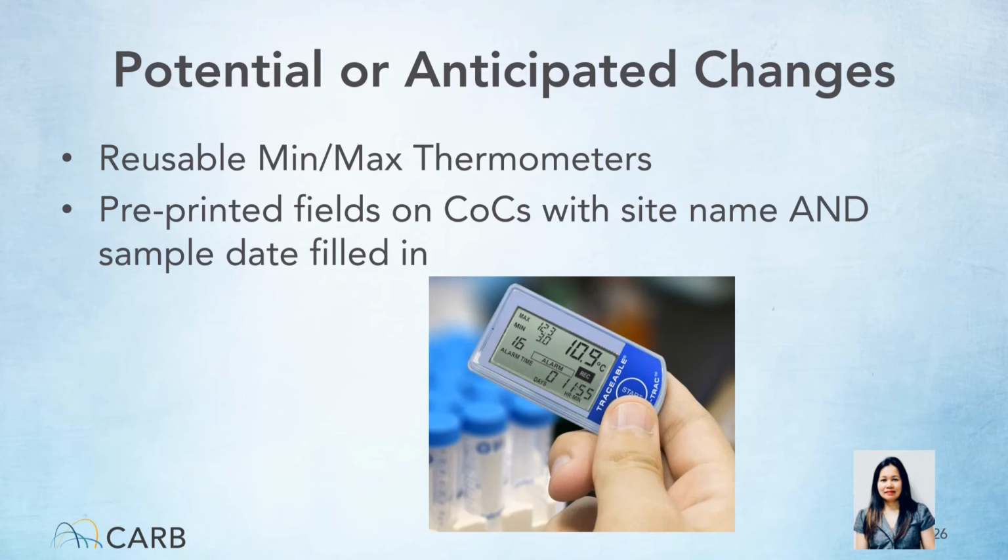This is very difficult to do without assigning every EPA scheduled sample with a LIMS ID before they go out into the field. More on this to come. We are just providing a heads up for now.